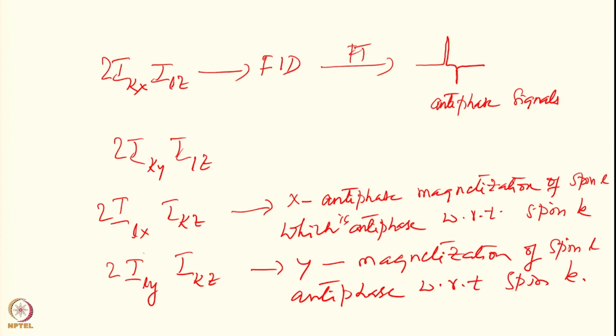and all of these are called single quantum transitions also. I will have to explain that in this context using an energy level diagram. Suppose I am taking a 2 spin system. Then I will have here alpha alpha, alpha beta, beta alpha and beta beta for the 2 spin system.